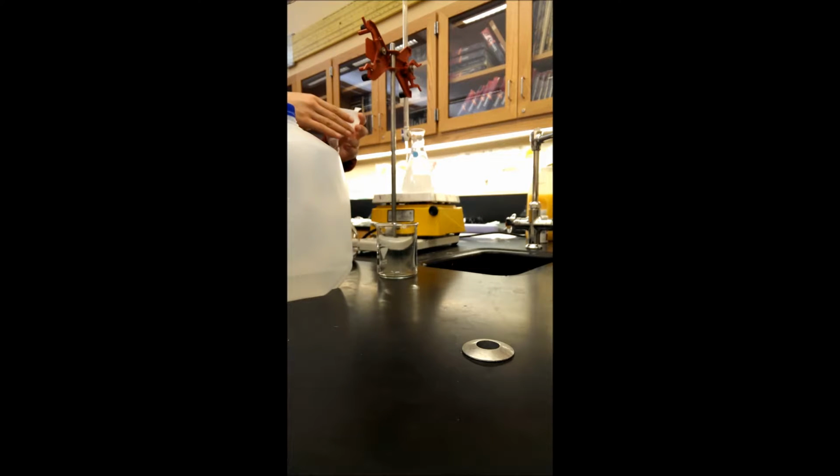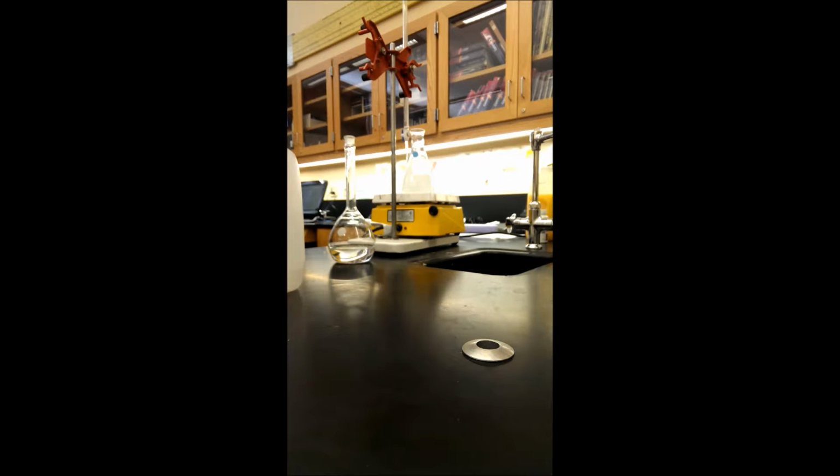And then 10 milliliters of hydrochloric acid and 5 milliliters of hydrogen peroxide. Both the hydrochloric acid and hydrogen peroxide are 1 molar.